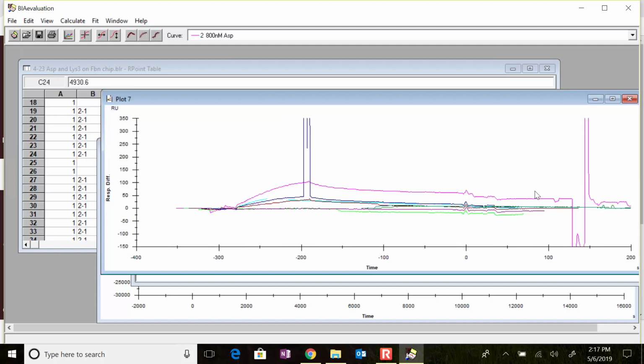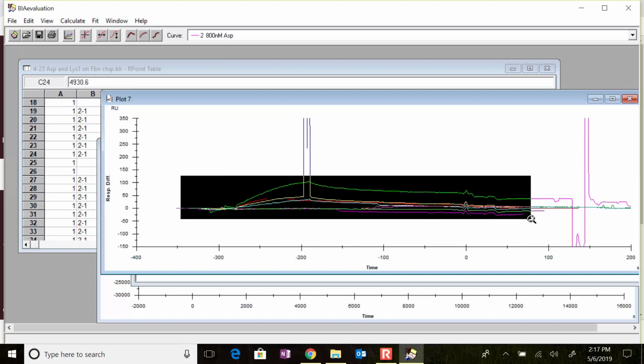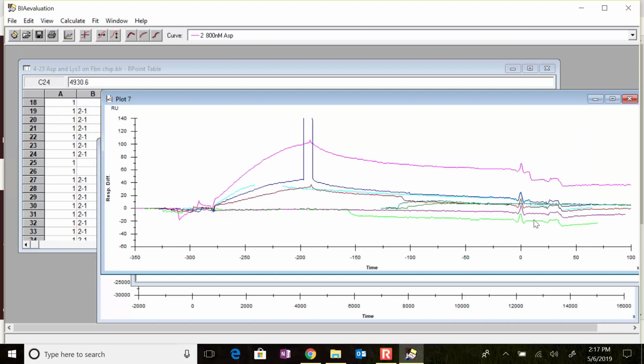Now I zoomed in, and if we include the wash feature, you can see that the wash feature is really lining up back here. See, it's all doing the same thing. And the one thing is, these might have been blanks that didn't have enough to them, or I might actually not have selected the whole thing. Whatever's going on, these don't look like they're lining up with everything else. But it looks like our purple blank is really good. It looks like our green blank just had a, actually this is completely accurate. The baseline was just sloping down because it was an early blank. And because of that, the baseline goes way down here, whereas the purple blank is nice and perfectly arranged and flat and things like that.